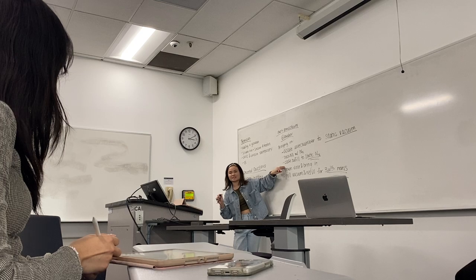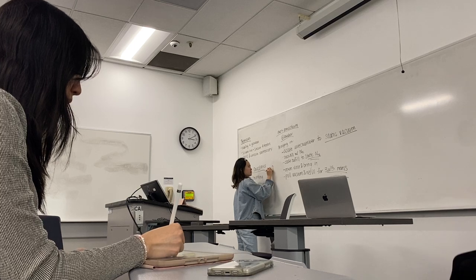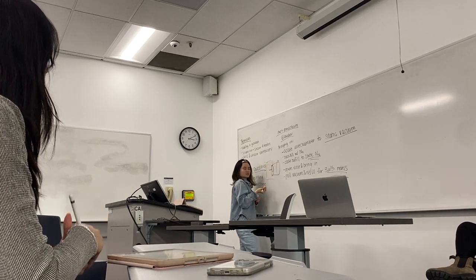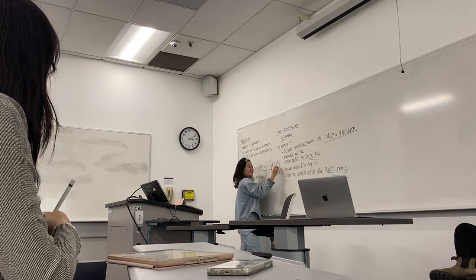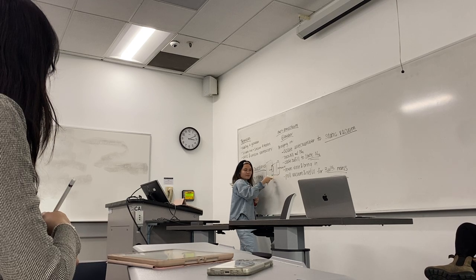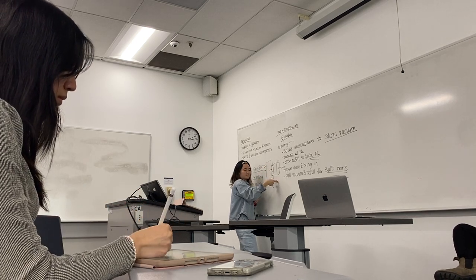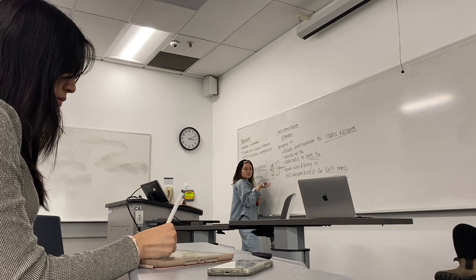You close the refill to static nitrogen because, let's say you have an antechamber with an inner door and an outer door. It's kind of hard to visualize without having the actual glove box. Let's say this is the antechamber glove box. If you open this door, the outside world, and this is under active nitrogen rather than static nitrogen, if there's a leak in your inner door, it can push oxygen in. So if you keep it under active nitrogen and there's a leak, it'll bring oxygen into your glove box. I think that's the reason.